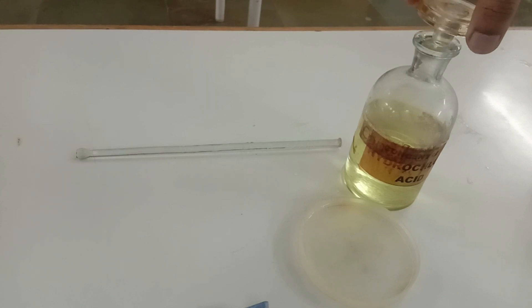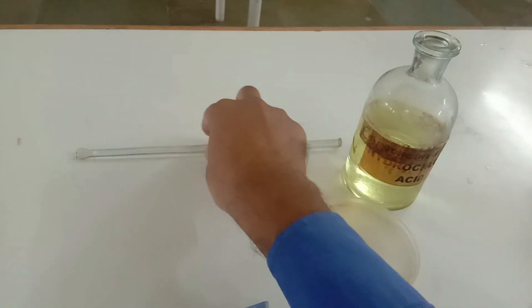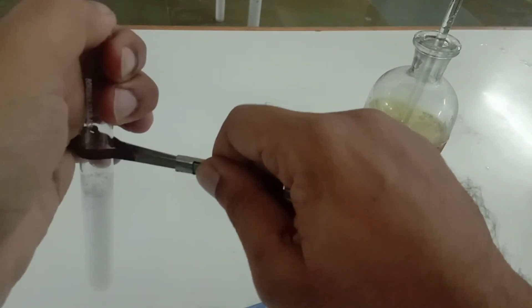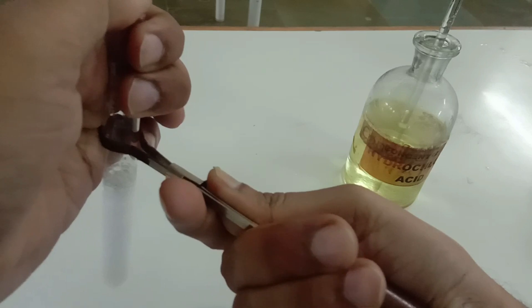Now I am going to dip the glass rod into the concentrated hydrochloric acid, and that glass rod dipped in hydrochloric acid will be gently placed over the test tube containing ammonia gas. As a precaution, I am using a test tube holder so that my hand doesn't come in contact with the concentrated hydrochloric acid.